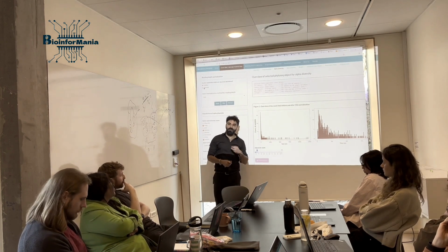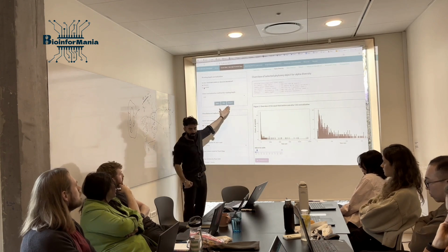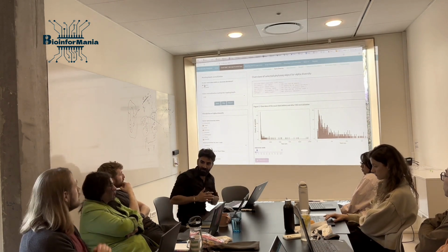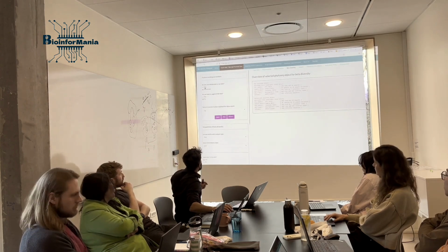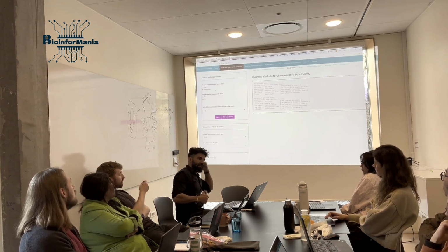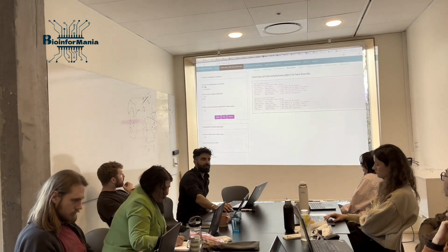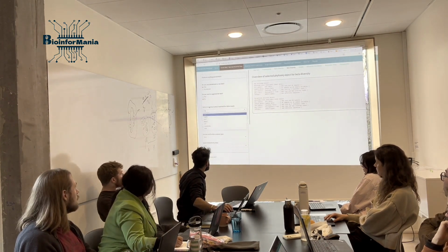We call this simplex data. It's proportional data, relative abundance. For ecological studies, it's fine. If you have corrected for this copy number, you can choose absolute. For beta diversity, if we go back again, there are two ways. It asks, do you want to take the previous steps, normalization and standardization, which I do, or do you want to just take the data as raw? You could also do that. Nothing wrong about it, as long as you know you do some transformations here.